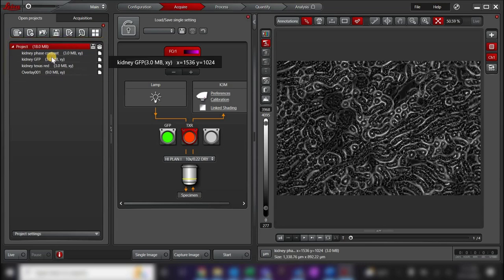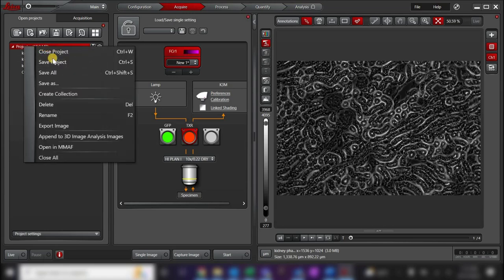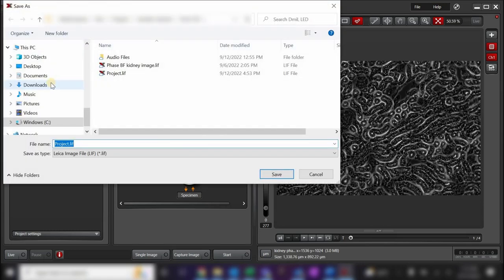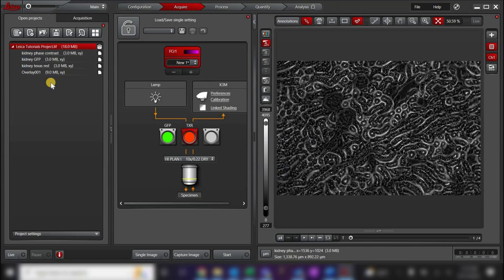To save your project, right-click on the project and select Save As. You can then name your project file. This will save all the images in your project under one file name. To access your individual images in the future, you can either reopen the project in the LASX software, or you can open your file in ImageJ or Fiji using Bioformat's importer. To learn more about opening LIF or Leica image files in ImageJ or Fiji, please see our YouTube video on opening LIF files in Fiji.